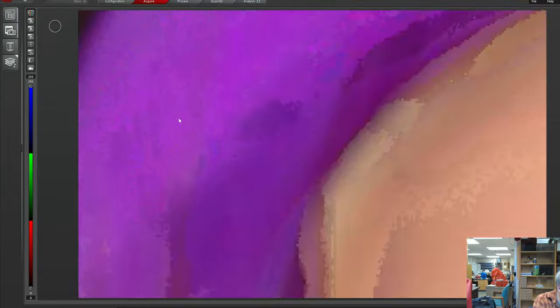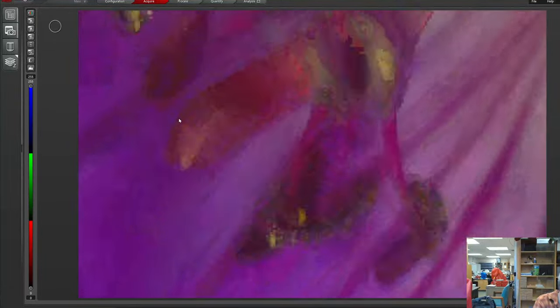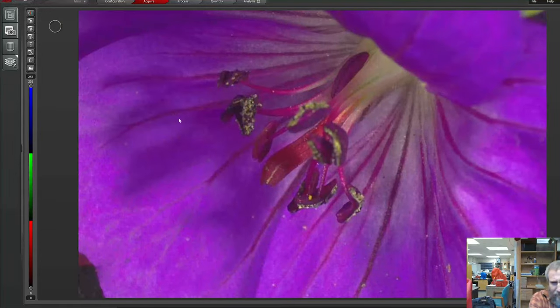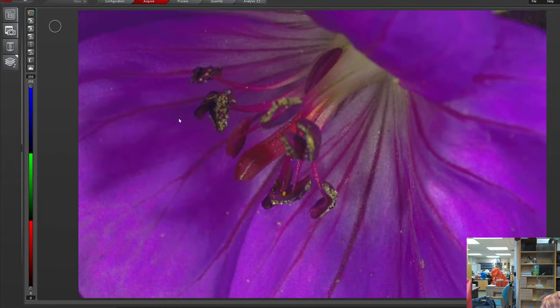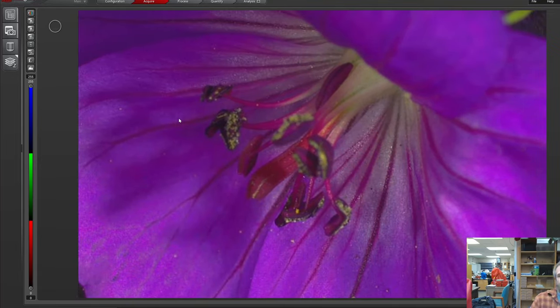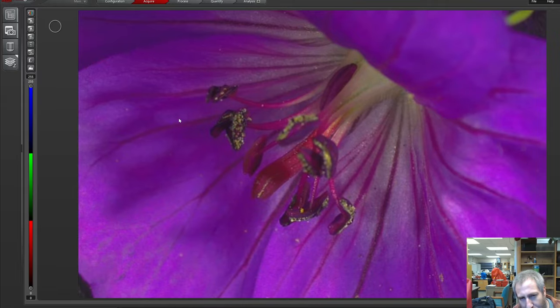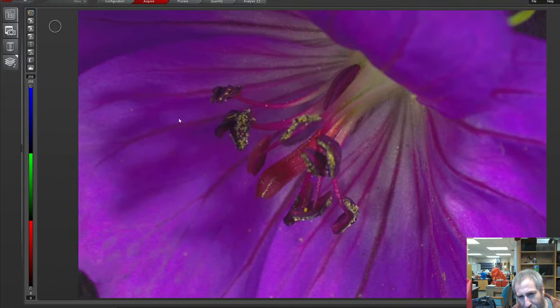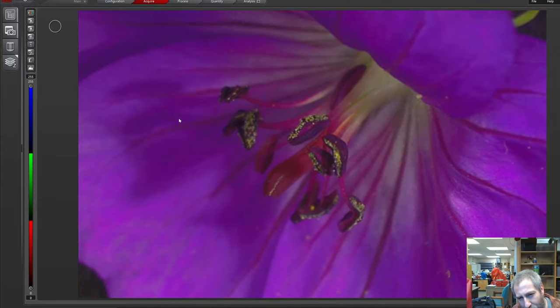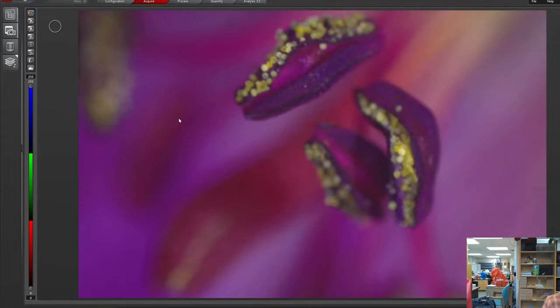Let's look at just one more little flower. See if I can fold back some of it, so we can see the sexy bits. The flower's sexy bits, I mean. Yeah, that's a really pretty shot. You can see again, the bright yellow stuff on there is the pollen. And as I mentioned, we have looked at the pollen specifically in the SEM on those little anthers. Let's just zoom in and take a look at some of those because I think they're kind of neat looking.